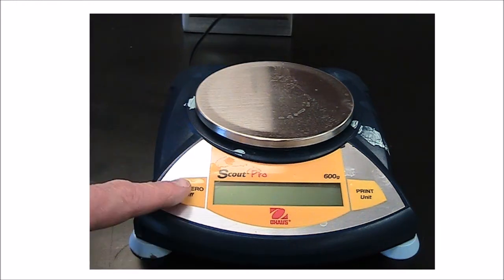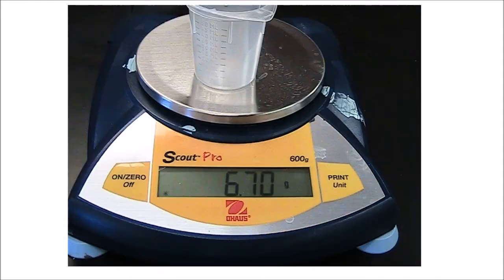Turning these on is very simple. Hit the on button, not too hard at all. When it first comes up, it'll read 0. I unfortunately didn't include a picture of that.